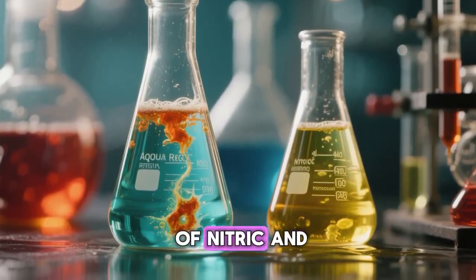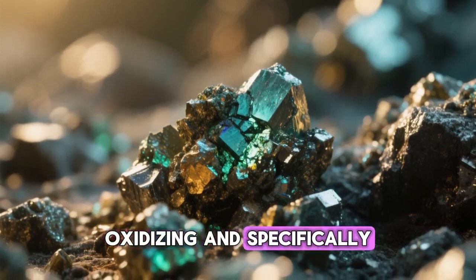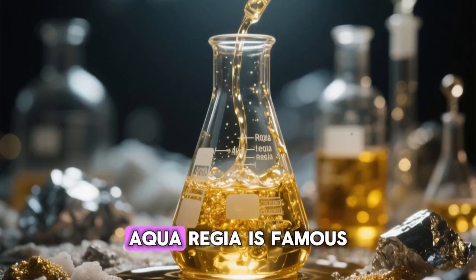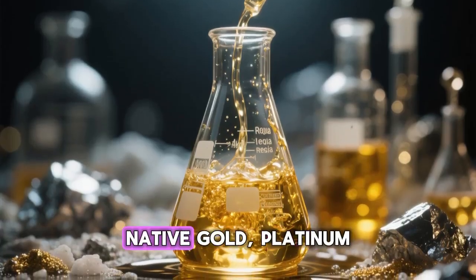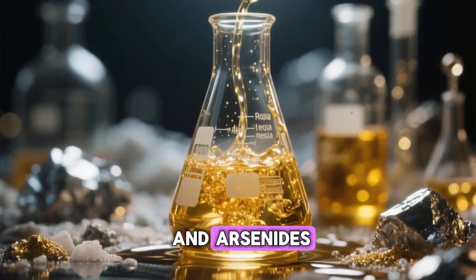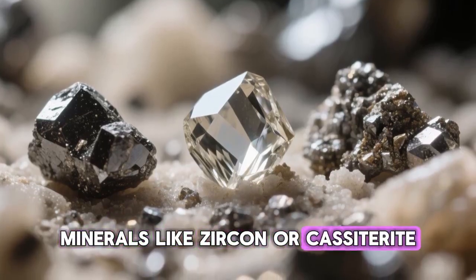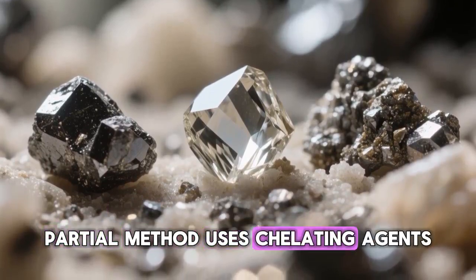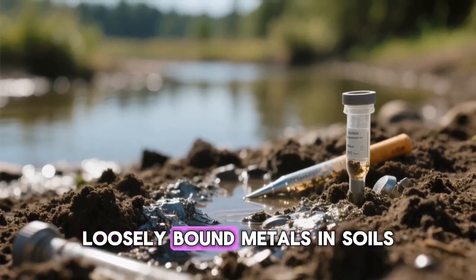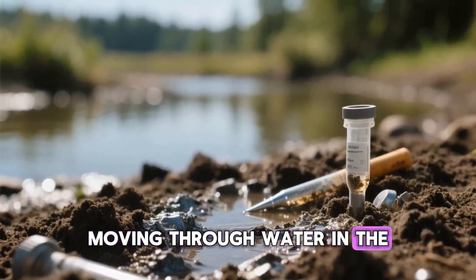This is a mixture of nitric and hydrochloric acids. It's highly oxidizing and specifically targets phases associated with mineralization, like sulfides. Aqua regia is famous for dissolving native gold, platinum, and palladium, as well as carbonates and arsenides. However, it won't touch very resistant minerals like zircon or cassiterite. Another partial method uses chelating agents, like EDTA. These are used to estimate loosely bound metals in soils, which can give us clues about how metals are moving through water in the environment.